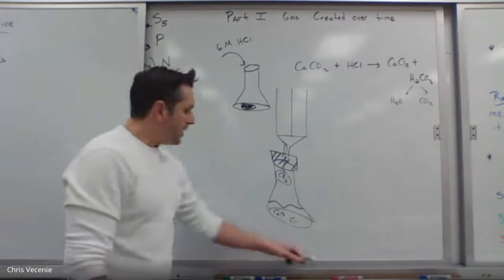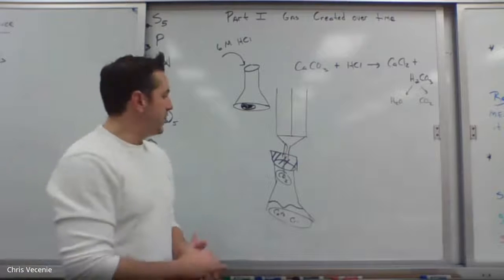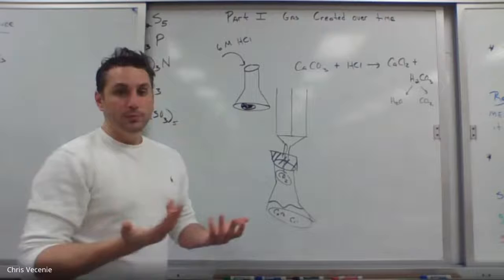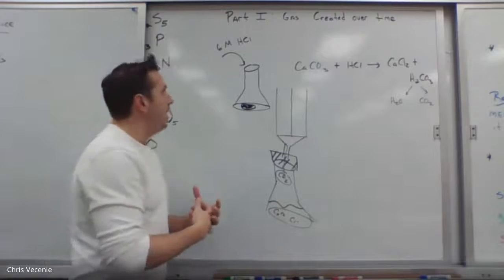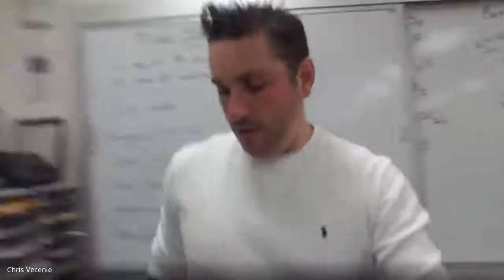All right, so I'll show you the beginning part of that reaction, and then you'll find out that in the procedure that I attached for you guys, the full data table will be pre-filled in. We don't have to watch it for the full 20 minutes. I just want you to see the process of how that's occurring. So let me take you to the back and show you that, and then we'll double back up front and take a look at part 2 of the experiment where we look at mass differential.